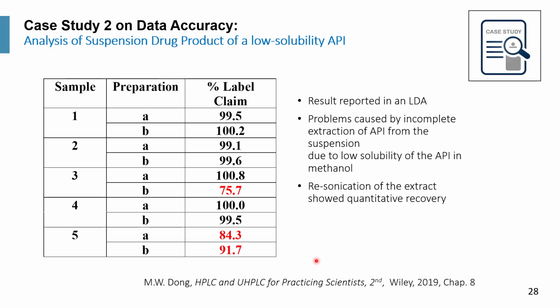It's not that the preparation of that clinical trial sample was incorrect. It is the non-robustness of the sample prep which was the problem. To fix that, we changed the method for extraction. We made the extraction sonication longer. We do it twice, and in the middle we do a shaking, and after that, there's no problem.